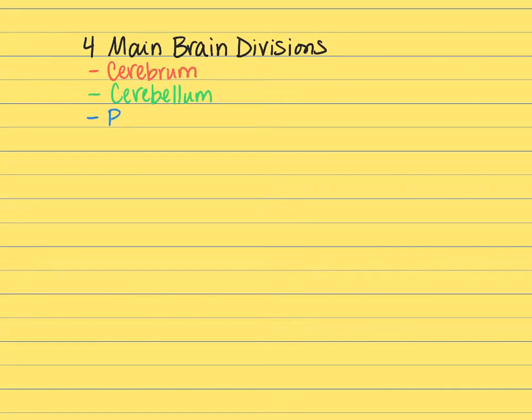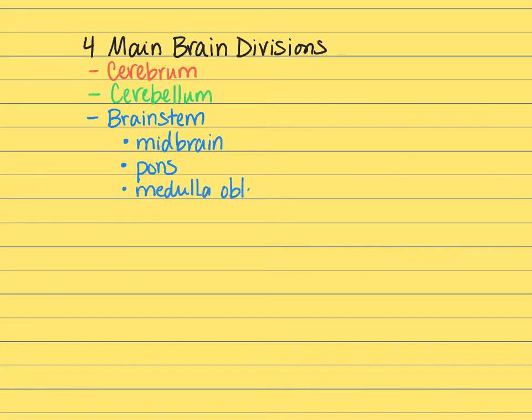We're also going to talk about the brainstem. And the brainstem consists of the midbrain, the pons, and the medulla oblongata.